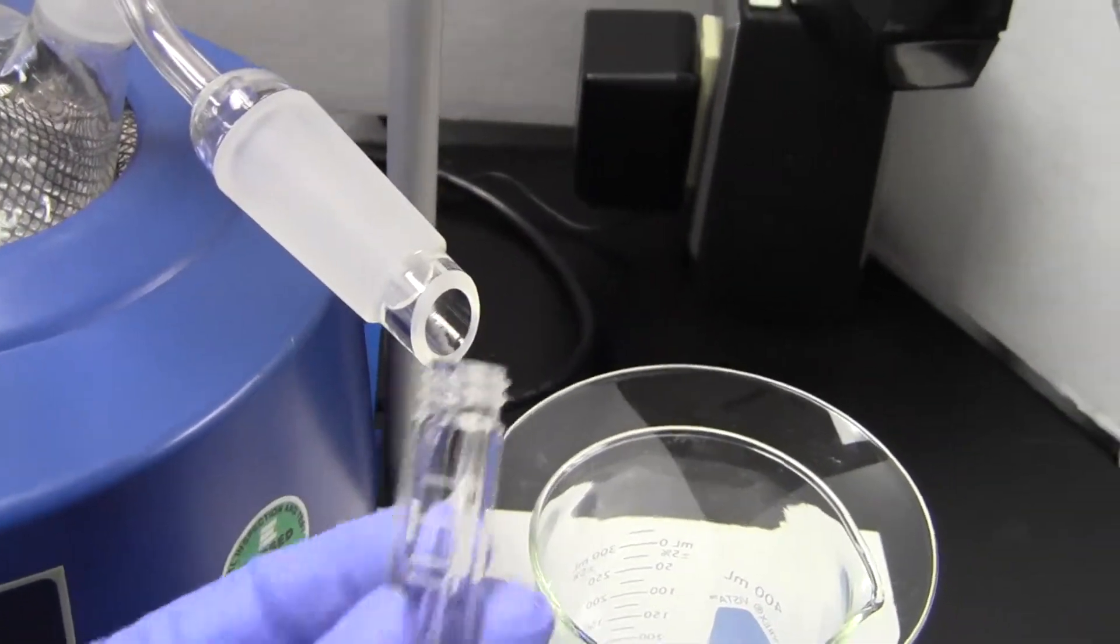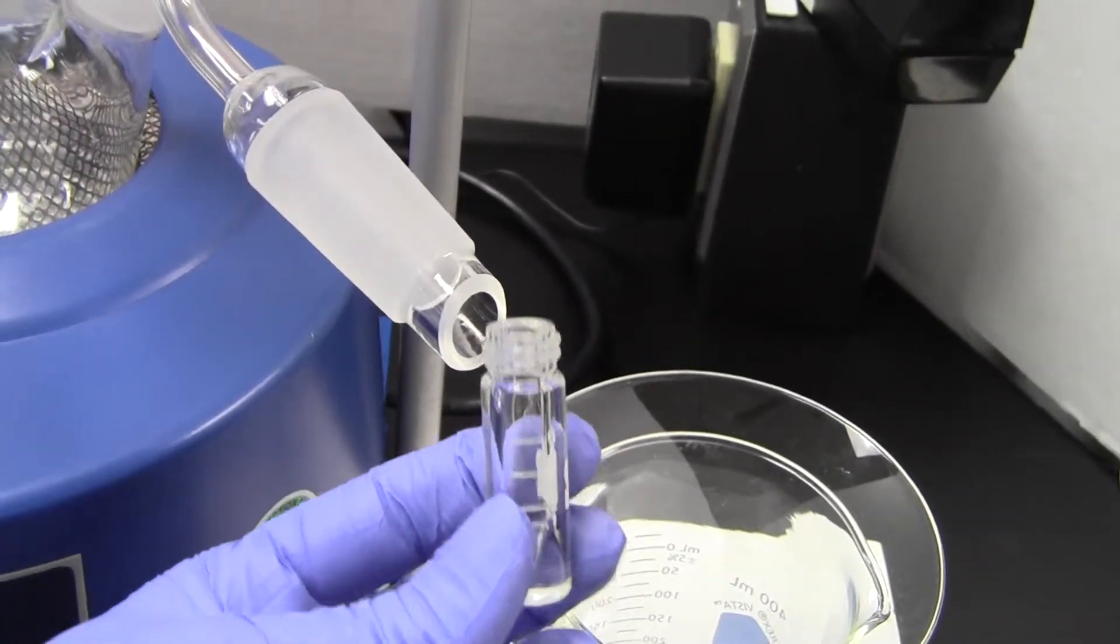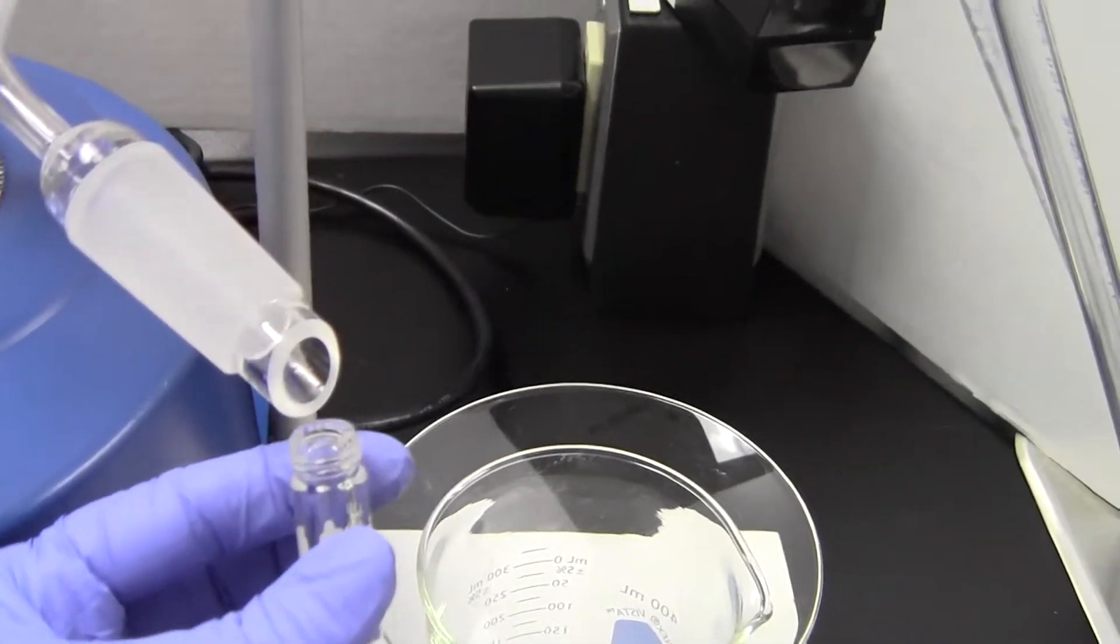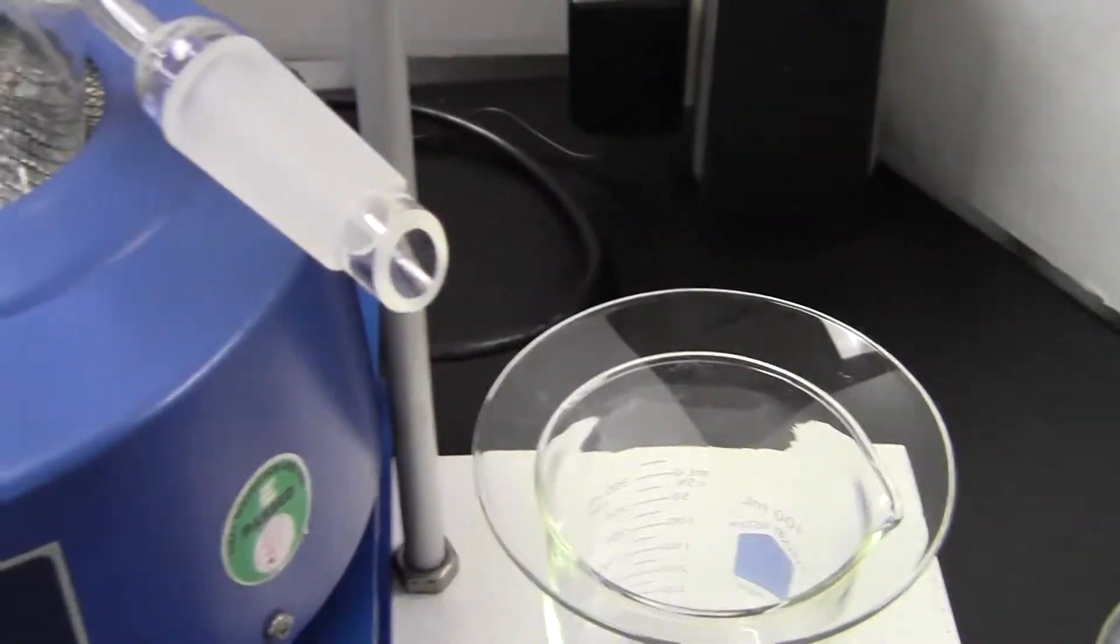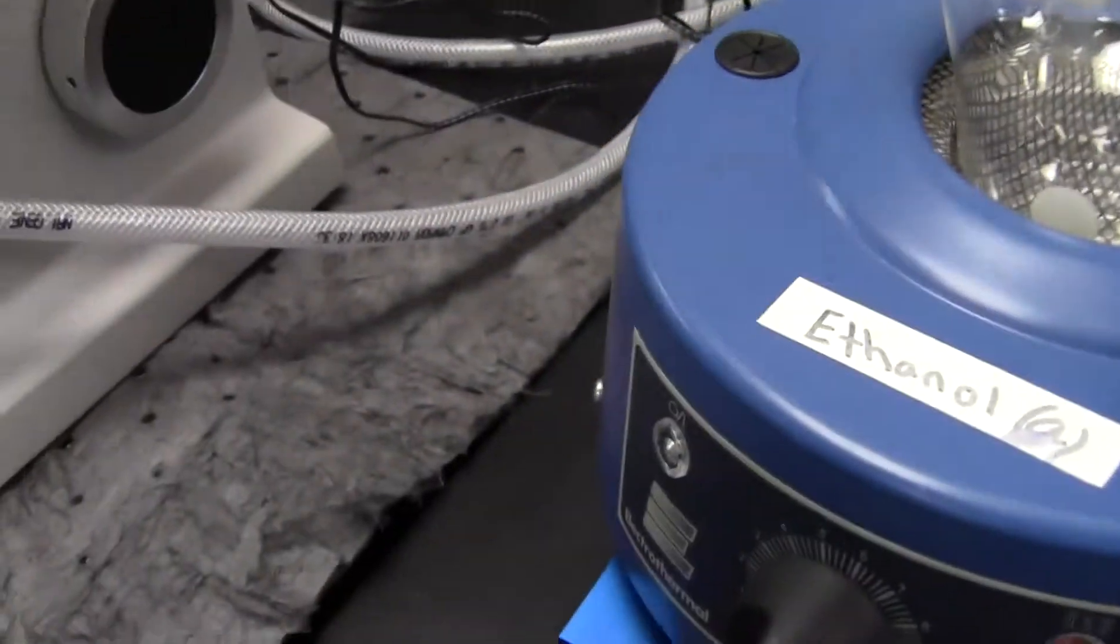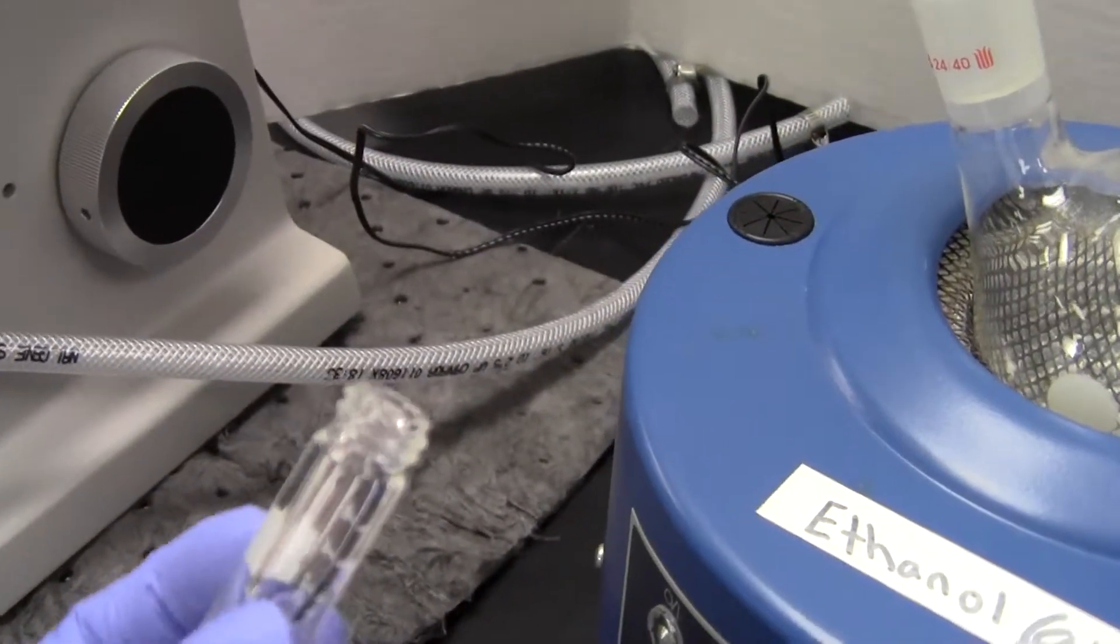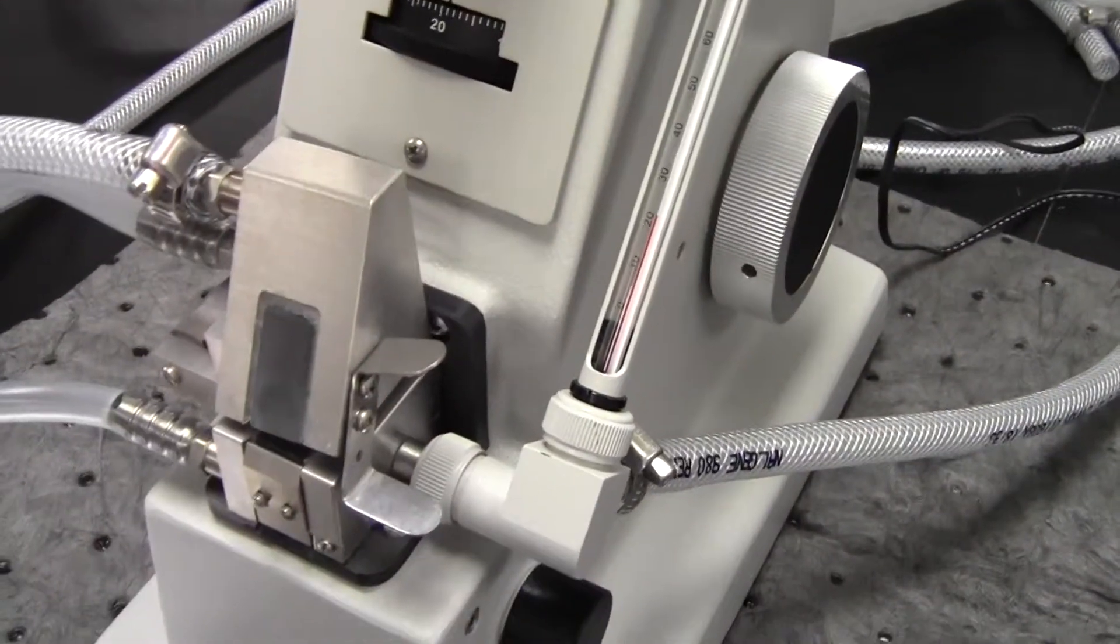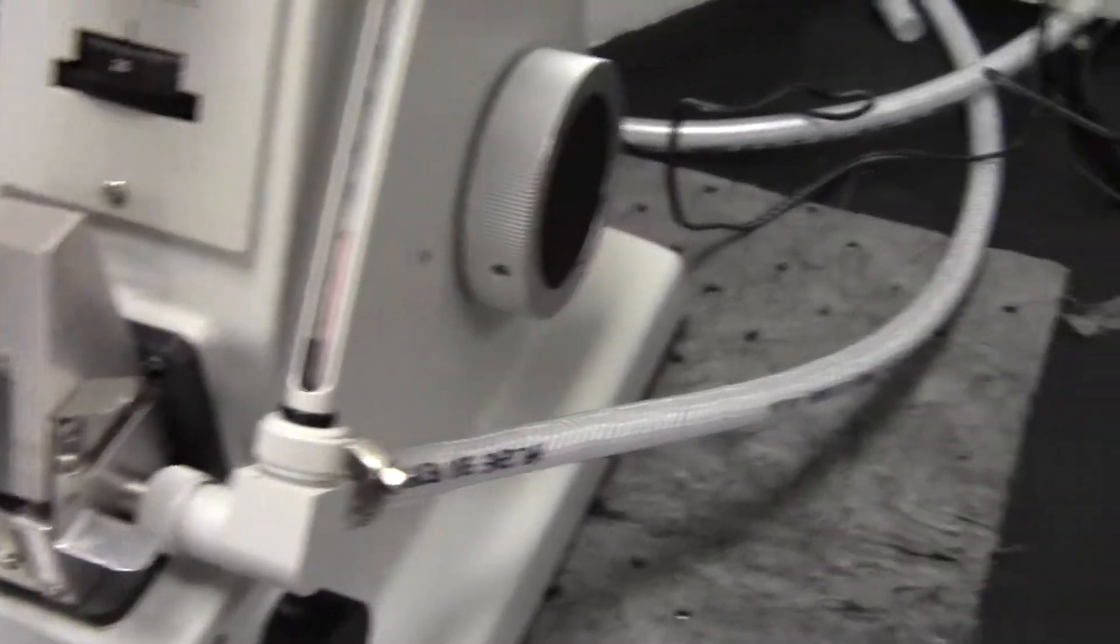A vial like this—this might not be the exact one; you'll want a little bit bigger one, but we'll supply that. Collect that in here, and then again with a nice clean pipette, take the liquid out of the vial and put it onto your prism and measure the refractive index.